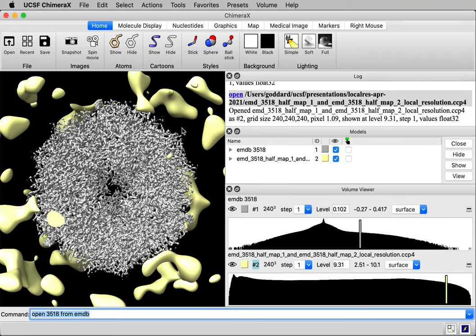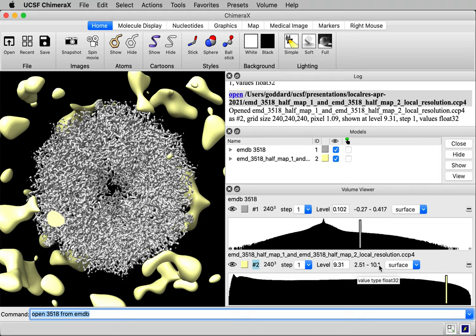Okay, it showed a contour surface of this local resolution in yellow. If you look at the histogram down below, it says the range of values is 2.5 to 10. So that's the range of resolutions that it computed at different points in the map, 2.5 angstroms to 10. We want to color using that.